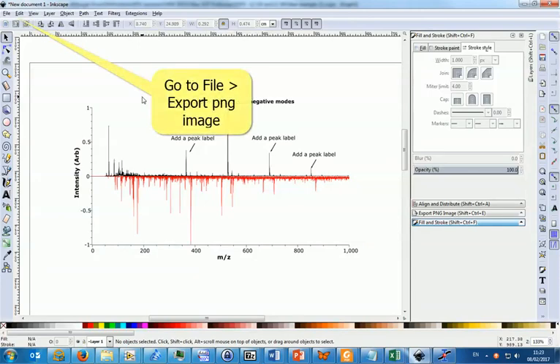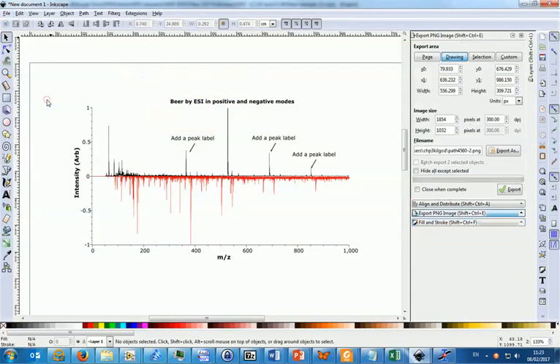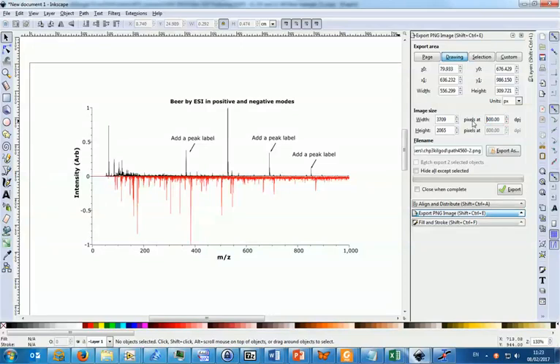To export the file as an image, go to the file menu and choose export PNG image. This brings up a set of parameters you can use to change the saved image file, but we can set the image resolution using this control. So set the image resolution to 600 dots per inch.